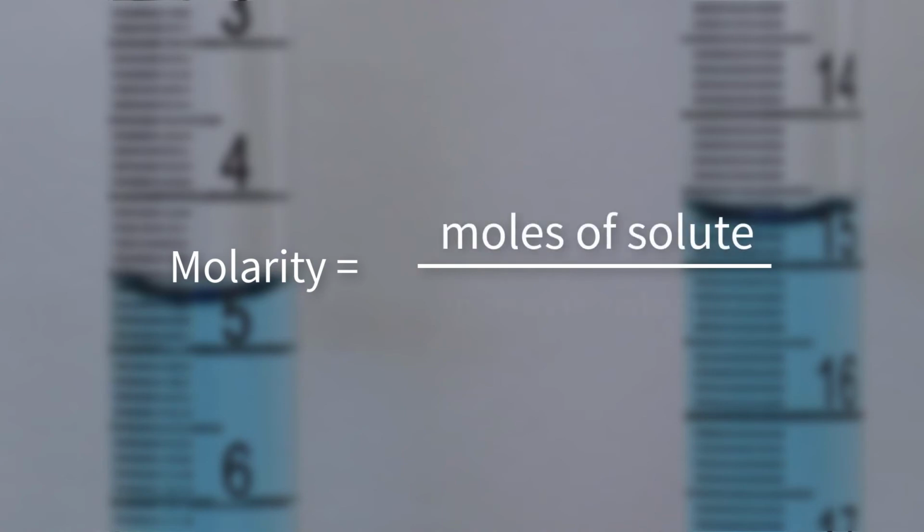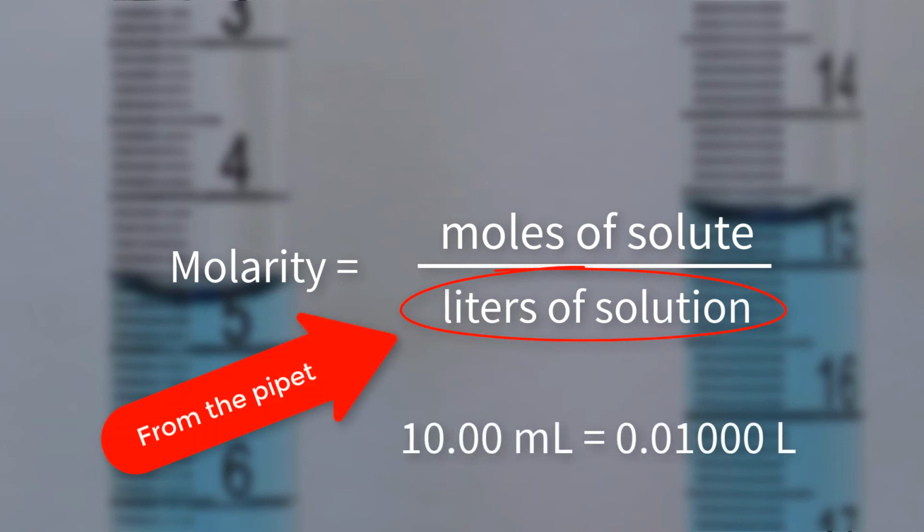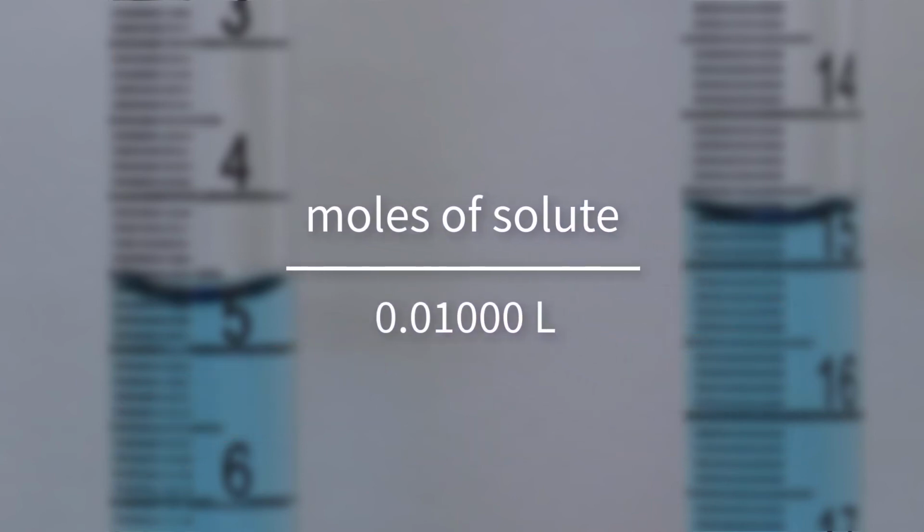Molarity is a unit of concentration and is defined as moles of solute per liter of solution. Since we are interested in the molarity of the acid solution, we need to know the number of moles of acid in a quantity of acid solution. Lloyd has already measured the volume of the acid with a 10 milliliter pipette, so we have that piece of the puzzle. We now need to convert to liters. There are 1,000 milliliters in 1 liter, so we can apply this conversion factor to get 0.01000 liters.